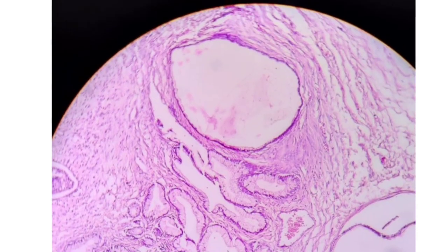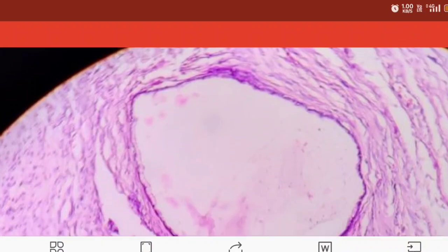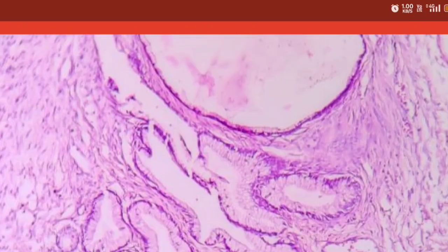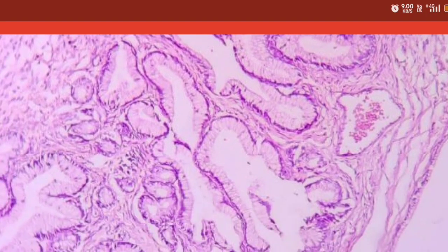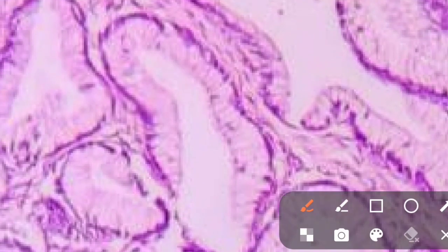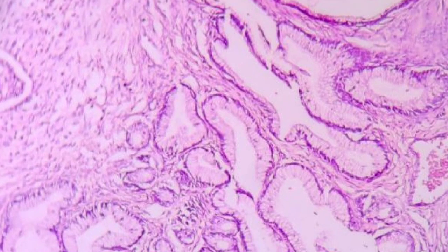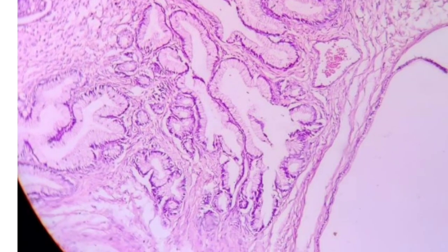Now coming to mucinous cystadenoma of the ovary. It is multi-loculated and filled with a thick viscid gelatinous fluid. Microscopically, you can see columnar cells with mucus filled inside, basal nuclei, and mucinous content. This is mucinous cystadenoma of the ovary.